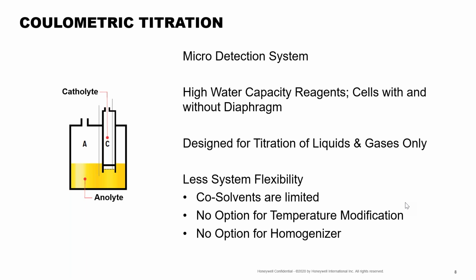Like I mentioned, both techniques are going to be sensitive to the influence of the ambient environment, but especially for coulometric, since typically we're measuring samples with much lower water content. And so any error that would introduce would be much more impactful on an absolute level when we're talking about coulometric titration. Just think about our current conditions, hot and humid, so we really need to protect our analysis from reading moisture in the air. There's some ways that we can do that with technique. There's also some ways that we can do that just with best practices with the product itself.